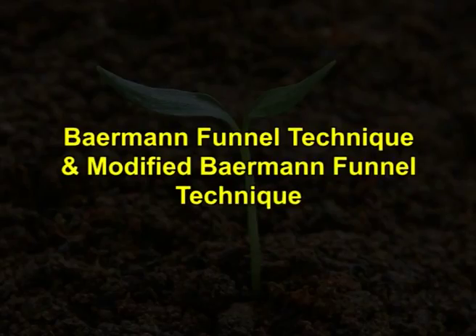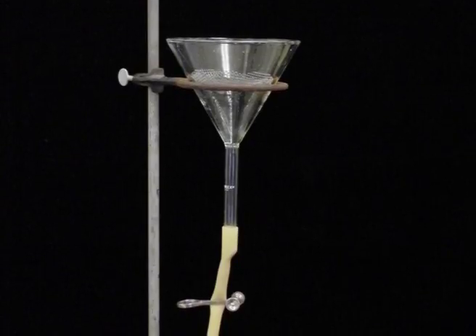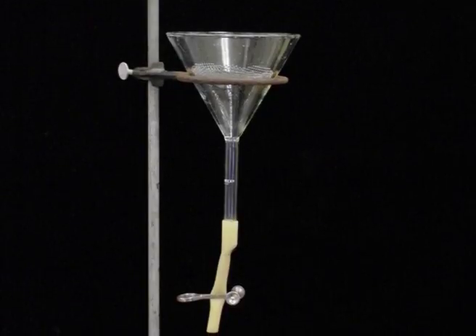The material thus collected from the sieves may be directly examined, or it may be placed in a Baermann funnel for additional separation of nematodes from soil particles. Baermann funnel technique and modified Baermann funnel technique. The Baermann funnel technique is the simplest method for extracting nematodes.